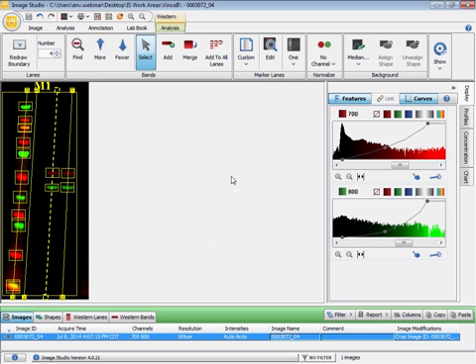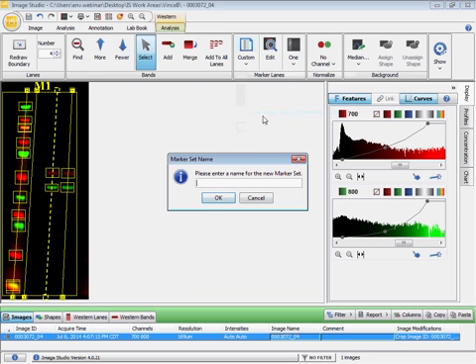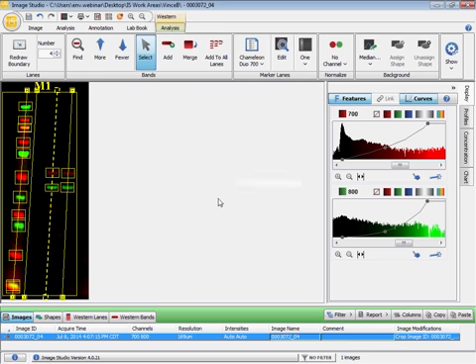Notice that the Select Marker Lane Set button has changed to Custom now. To save the new marker lane set, click this button and Save Marker Lane Set from the drop-down menu. Enter an appropriate name for the set. In this case, let's use Chameleon Duo 700 and click OK to confirm the name.